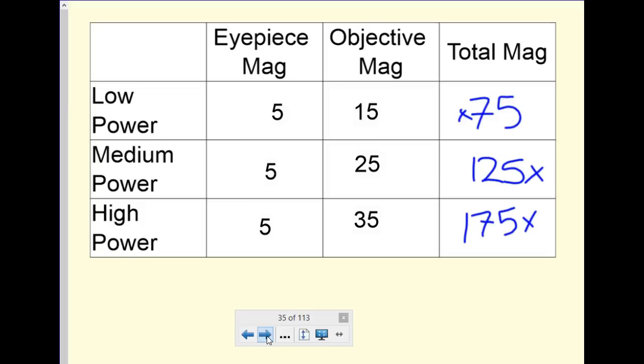By holding your slide on an angle, that methylene blue will go underneath. If you add too many drops of methylene blue, it will be so dark you won't be able to see it. So you want some methylene blue, but not a lot. Then take a look at the blue area underneath the microscope and see what you see. Really cool.